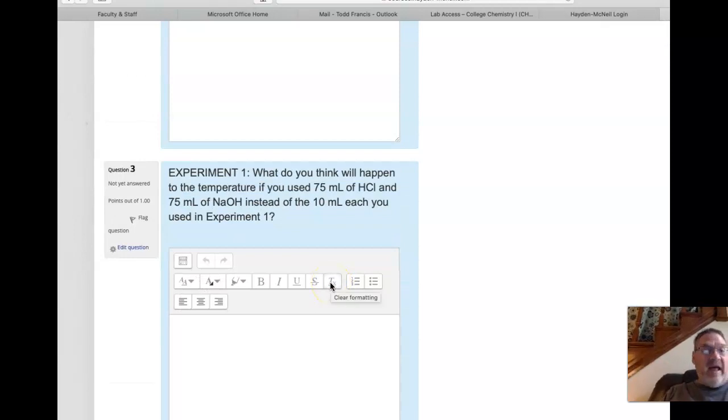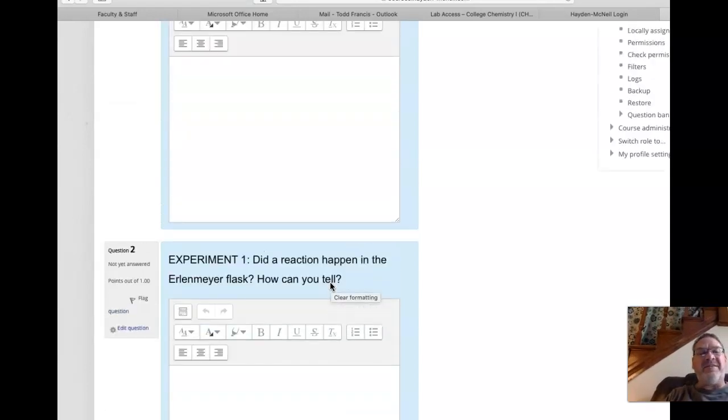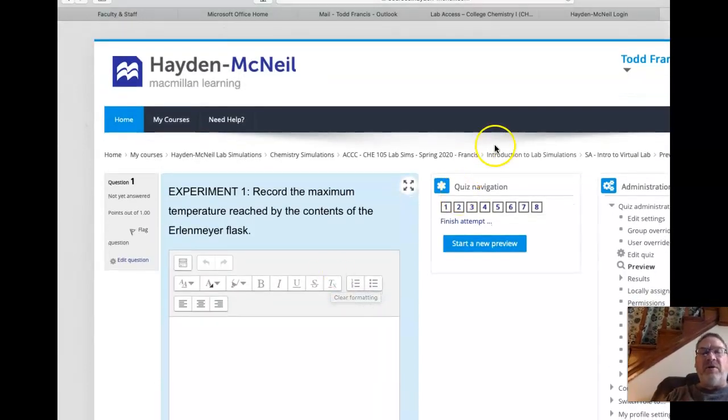So that's the lab. As you do the work, you will want to write down your results, because from your results, you're going to be able to answer the questions in both the multiple choice and the short answer questions.